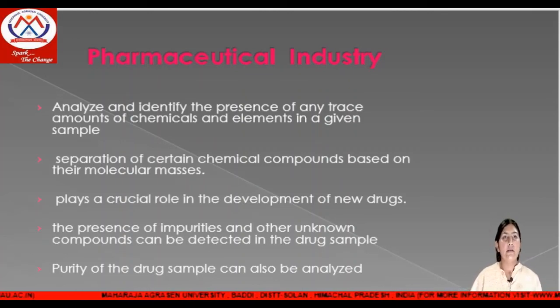We can use this technique for the separation of certain chemical compounds based on their molecular masses. Chromatographic techniques play a crucial role in the development of a new drug, and they keep a check on the quality of the drug. The presence of impurities and other unknown compounds can be detected in the drug sample.